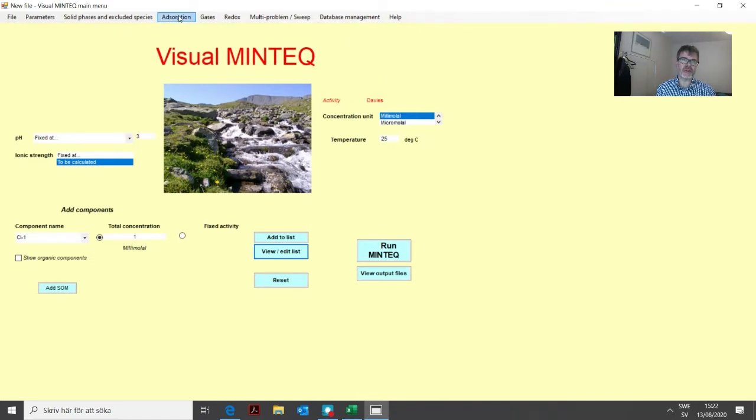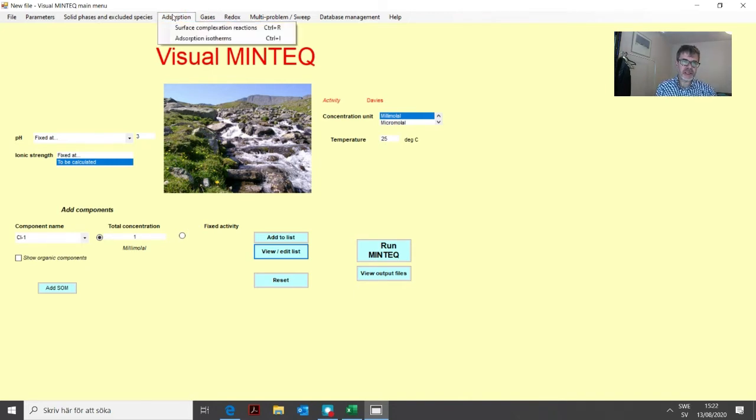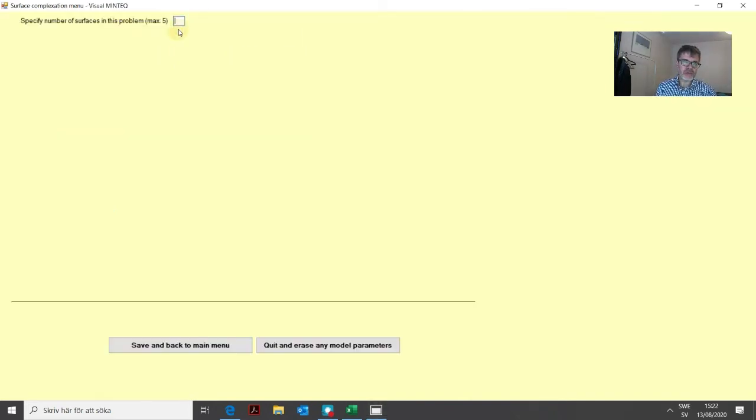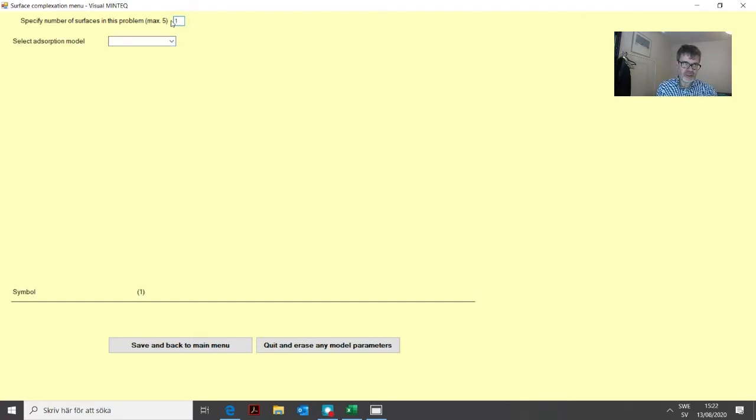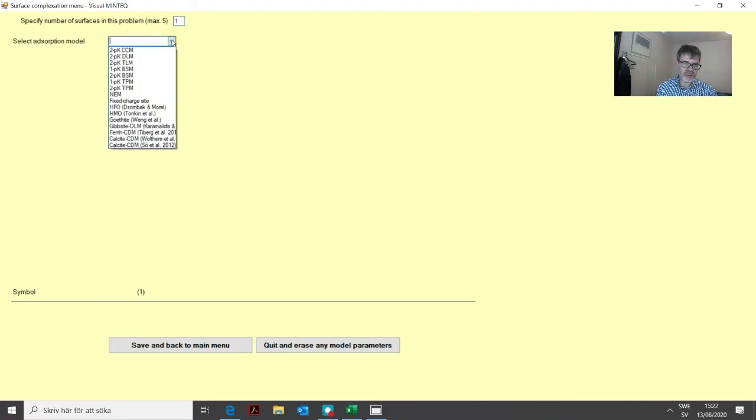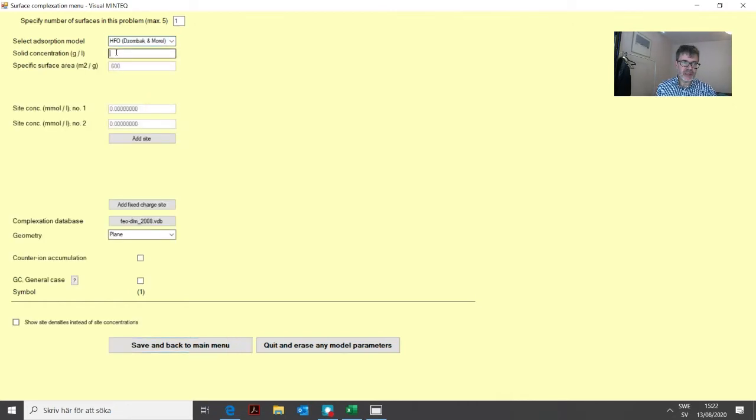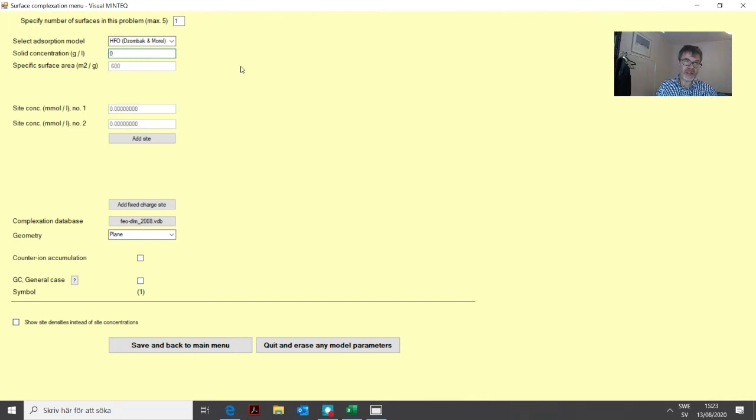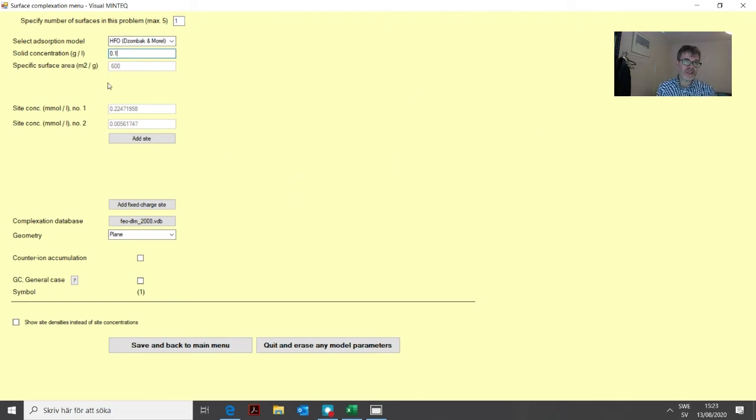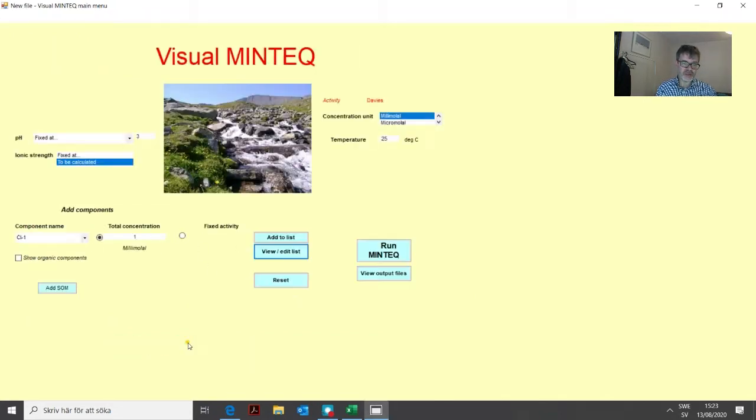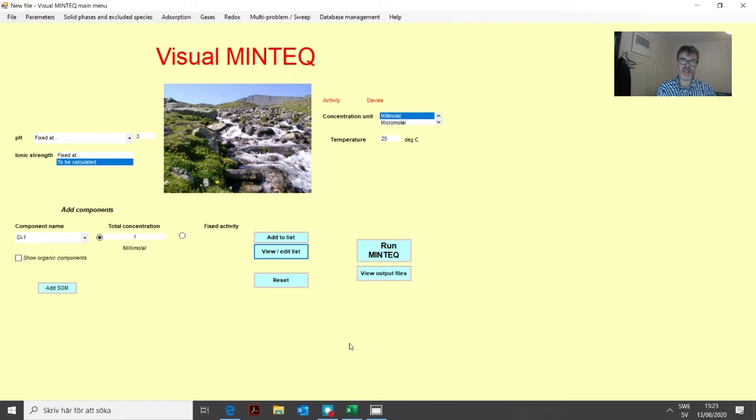Then we define the adsorption reaction before we start with the sweep. Let's assume we use the Dzombak and Morel model. We specify one surface, go to HFO Dzombak and Morel, and assume we have 0.1 grams per liter of ferrihydride. We accept the rest of the settings and save and back to main menu.